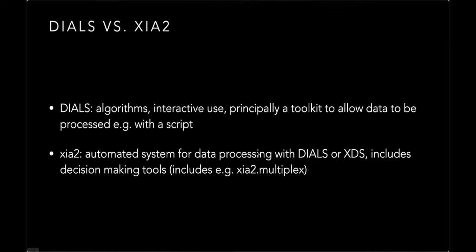If you're using DIALS, many different facilities run DIALS through the medium of xia2. xia2 has been around for 17 years now, I believe, and it started off life being there to run MOSFLM and XDS. These days, it's more commonly used to run DIALS or XDS. The idea is it's a completely automated system: you give it the data that you want to process, you set it going and ignore it. DIALS is slightly different. It's a toolkit. It's about algorithms. It's about interactive use.